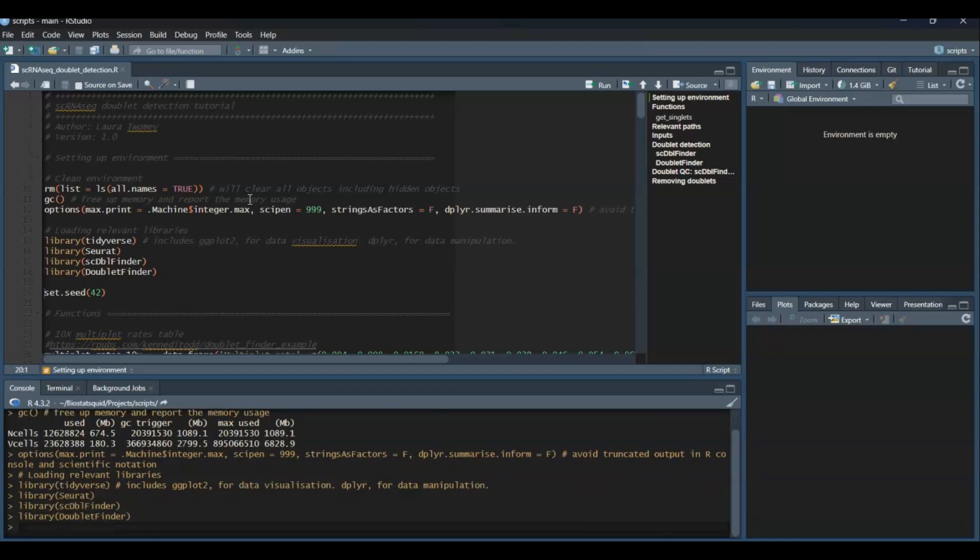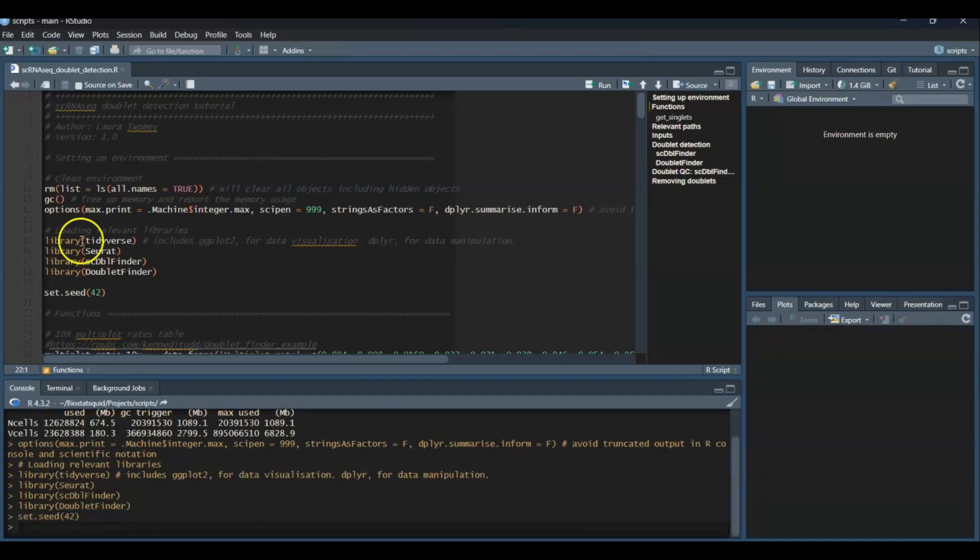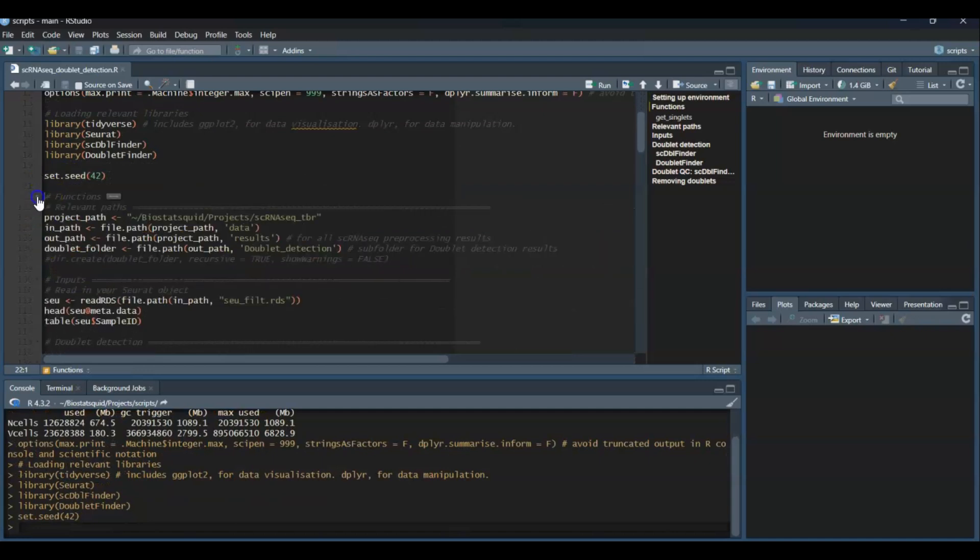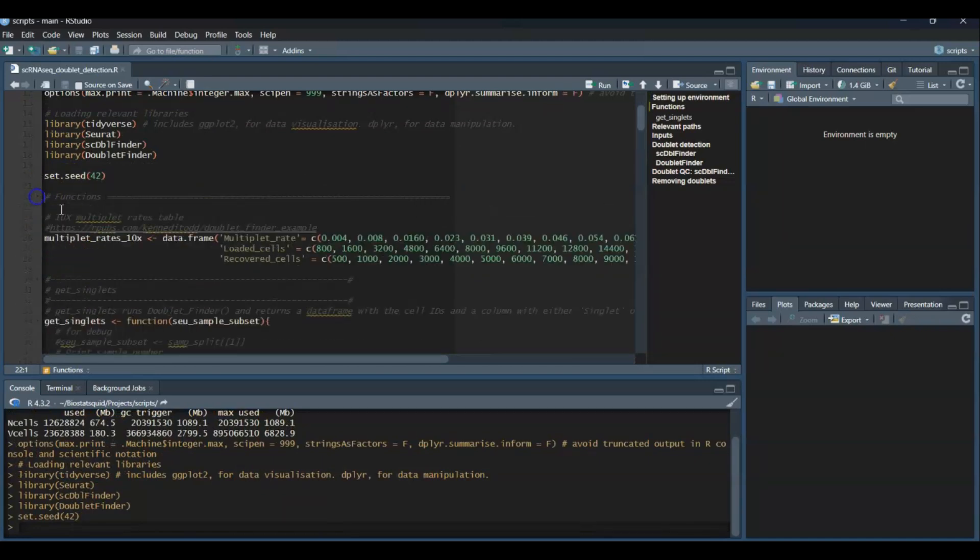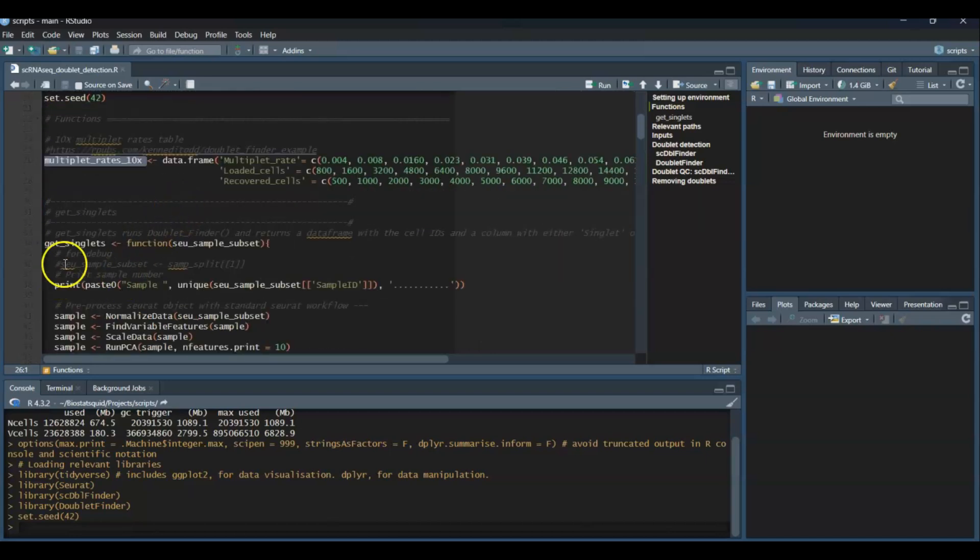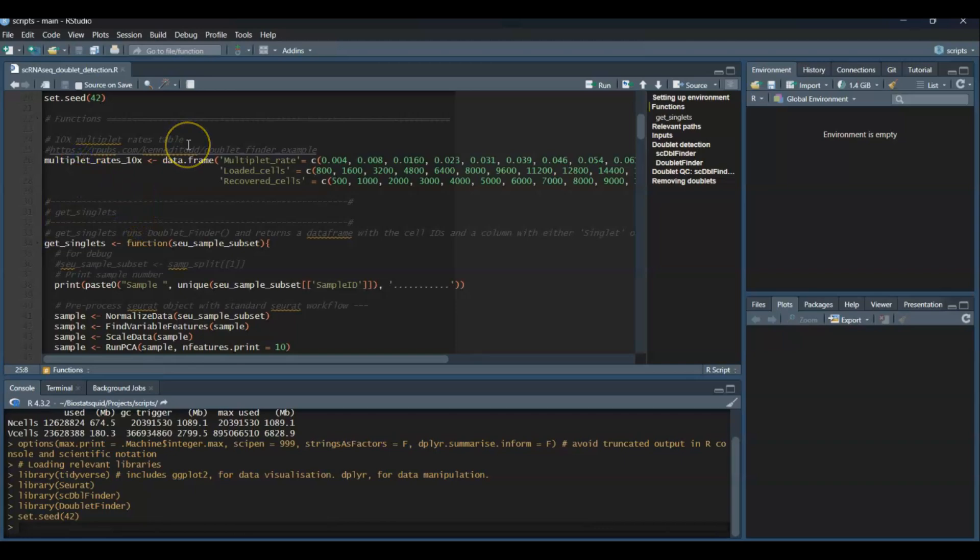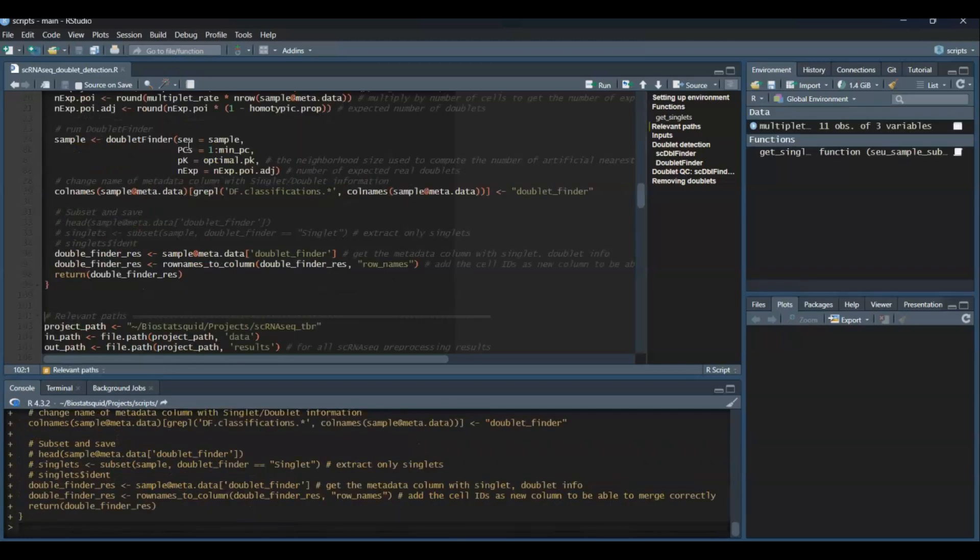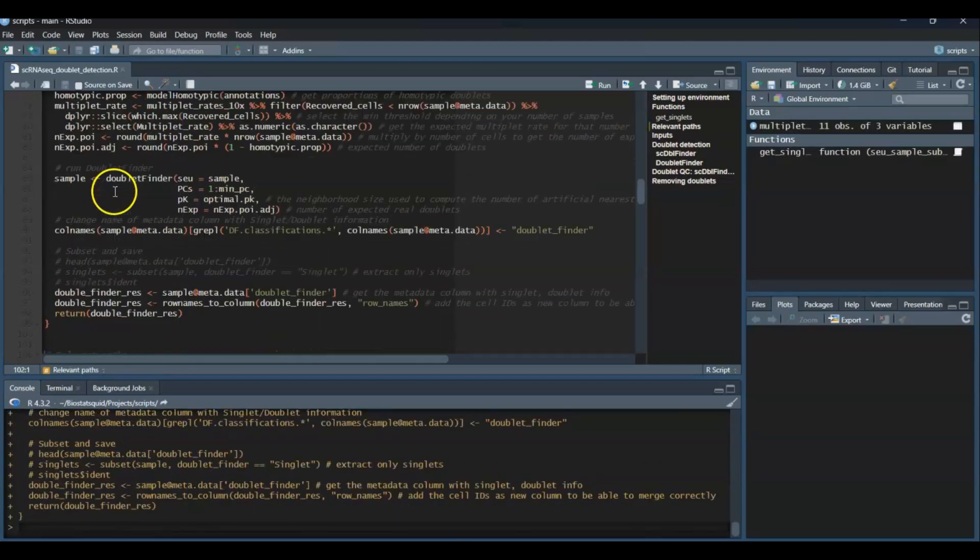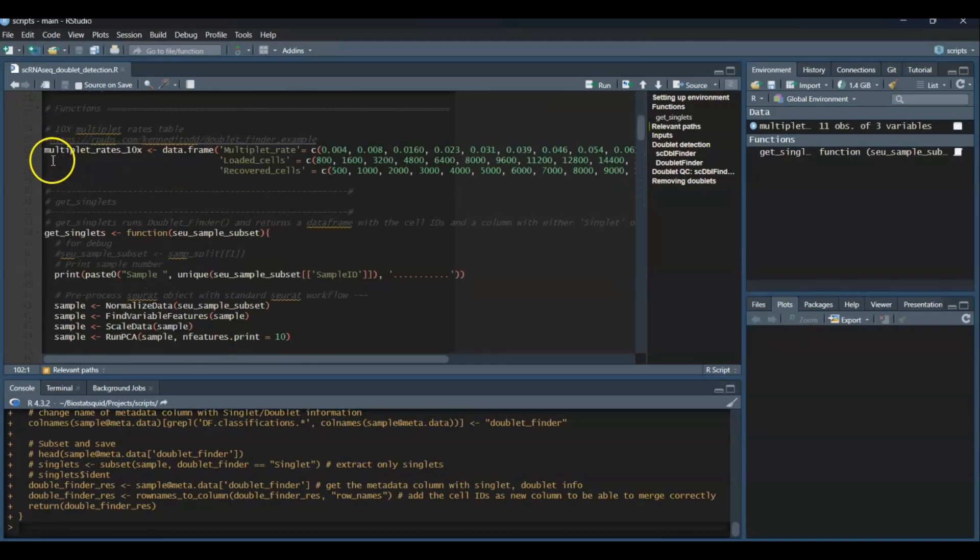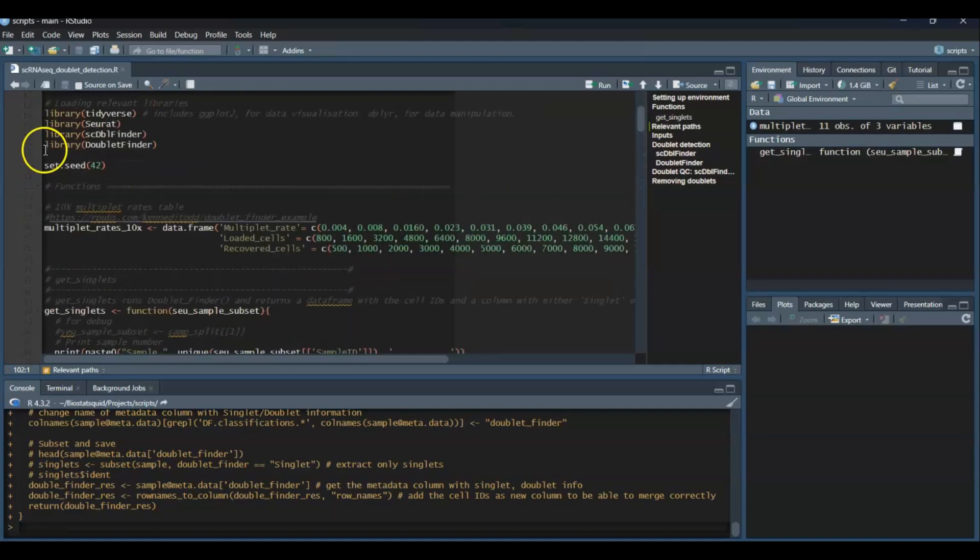In this function section I will actually load the multiplet rates from 10x, as well as a custom function called get_singlets, which I will explain later on when we cover doublet detection with DoubletFinder. So I will just run that for now, but we will cover it later on.